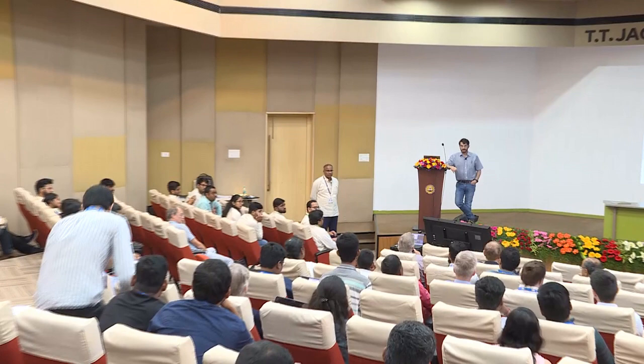Very powerful technology. And I'm wondering at the smaller end, so most droplets come in at 10 microns, 50 microns, but some applications would be really nice to get into this 1 micron and below level. Do you have ways of achieving this? I know surface tension is against this whole endeavor, but are there capabilities in capillary microfluidics to break this sort of 1 micron barrier?